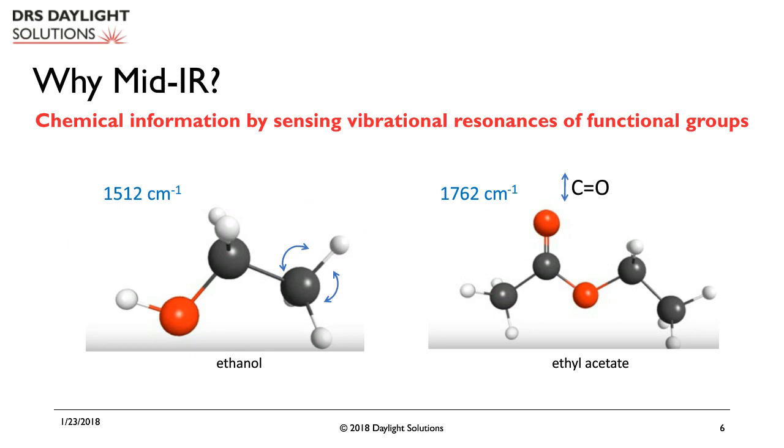This power to directly measure the bending and stretching of the bonds of the molecules of interest is referred to as the vibrational resonances of these functional groups. These are the bending, stretching, and rotation of the molecules that is directly measurable in the mid-IR.